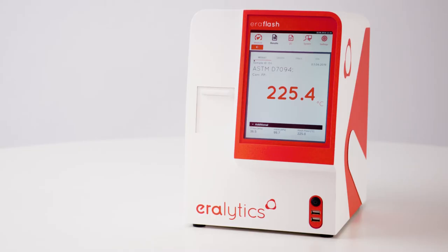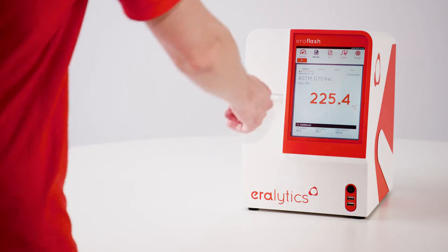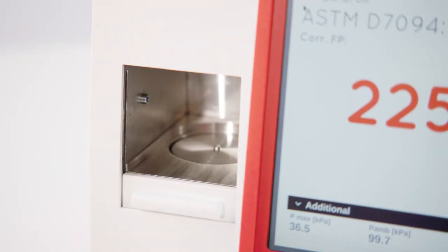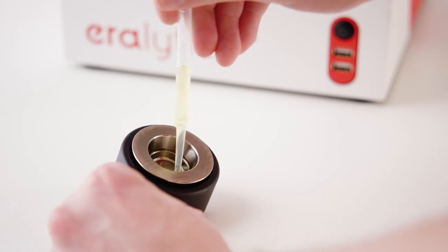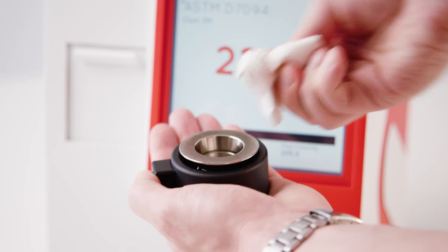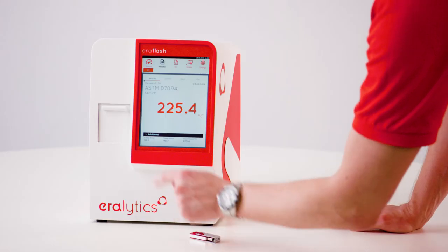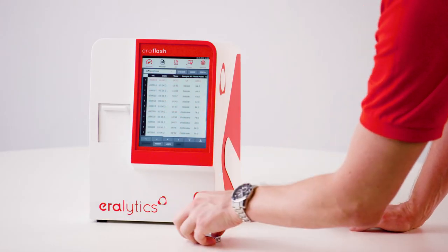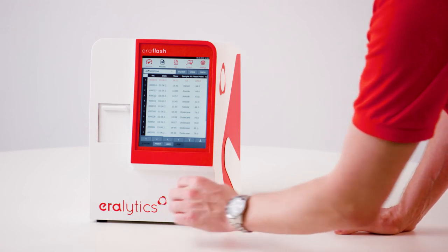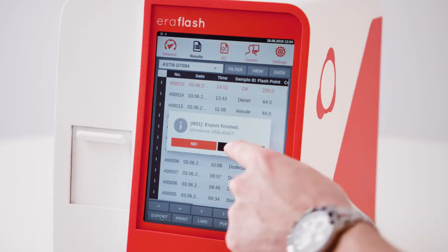After a high temperature measurement, the sample cup is actively cooled down to enable faster turnaround and safe handling. As follow-up, empty the cooled cup and wipe it with a tissue. The results are stored in the internal memory and can be conveniently exported to a USB drive, printed, and transferred to a LIMS.